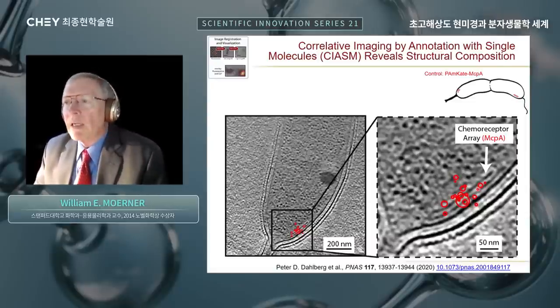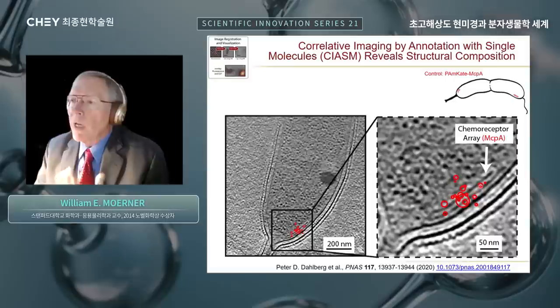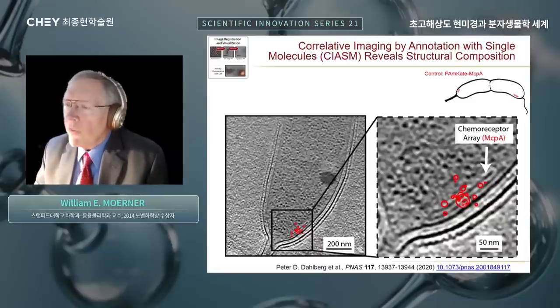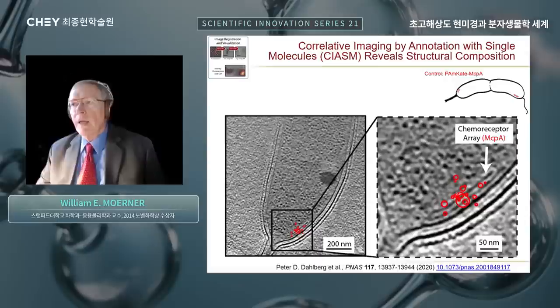As a side comment, at low temperatures, we get a lot of photons because these molecules don't photobleach very, very quickly. So we get more photons, therefore we get more precision on the localization of these single molecules, even down to 8 nanometers and below for some of these molecules shown here. But there is a statistical distribution of the diameters, as one would expect.